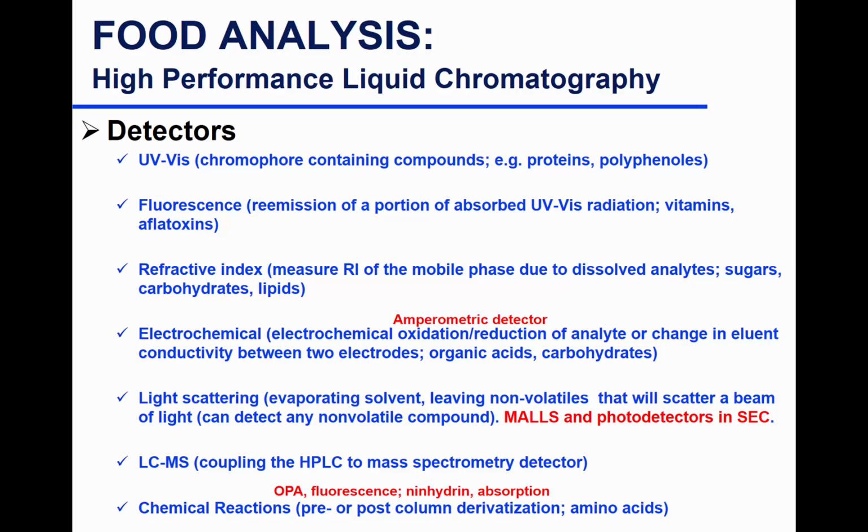Is one better than the other? No, it's a good question. It depends on what you have in your lab. Do you have a fluorescence detector in your lab, and is your personnel more familiar with it? If you don't have an automated post-column reactor, then you wouldn't do that. Does automation increase your replications or anything, since it's generally done by a person? Well, actually if it's automated, it would reduce the experimental error if your system is working well. So theoretically it's easier that way if you have the system. Yeah.